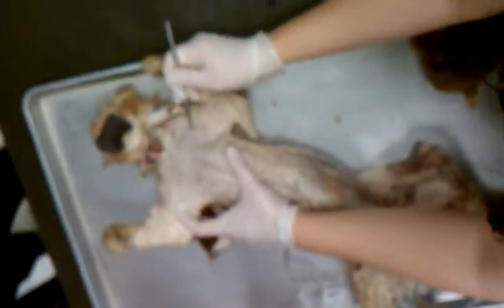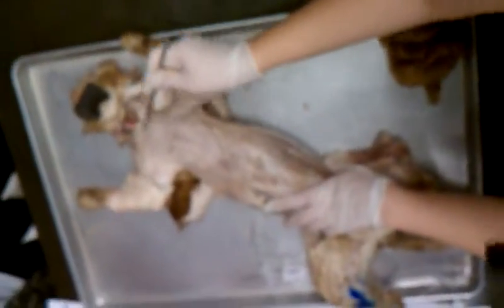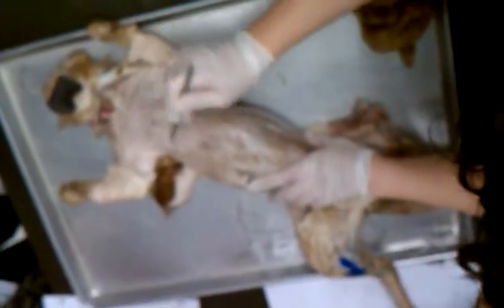We don't pounce, right? Now lower here, these guys right here, this is pectoralis major. And then lower, you can see making this V right here, this is pectoralis minor. And then even lower, you can see another V. This is that one I talked about last week when I was talking about origin and insertion. This one is the xiphihumeralis, and it attaches to the xiphoid process on the sternum, and it eventually runs all the way up to his humerus. Okay, so one more time: pecto-antebrachialis, pectoralis major, pectoralis minor, xiphihumeralis. Okay.